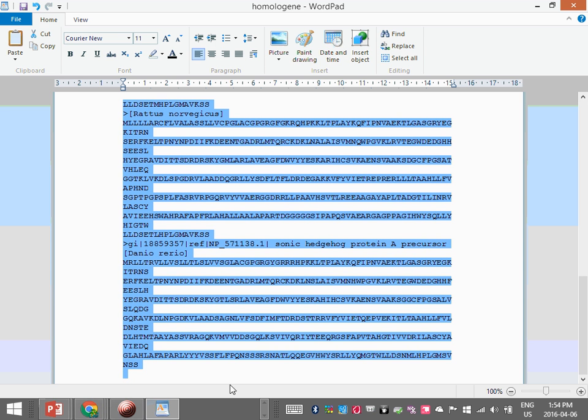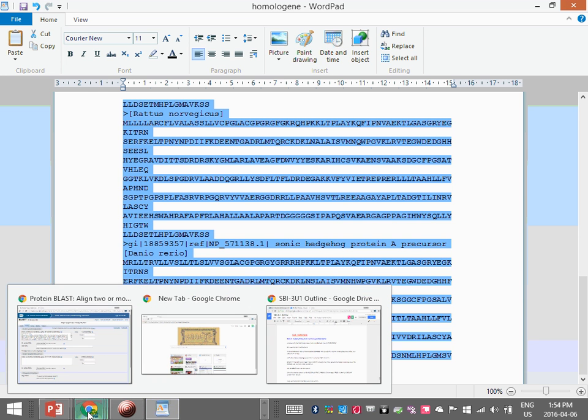Now you don't have to do the human. You could pick the zebrafish to those 5 sequences. It's going to make the graph for you. Okay? So I'm going to copy and paste.